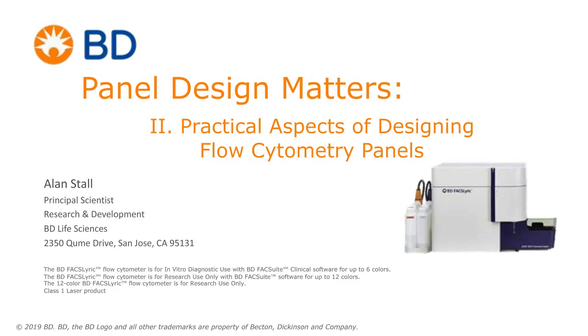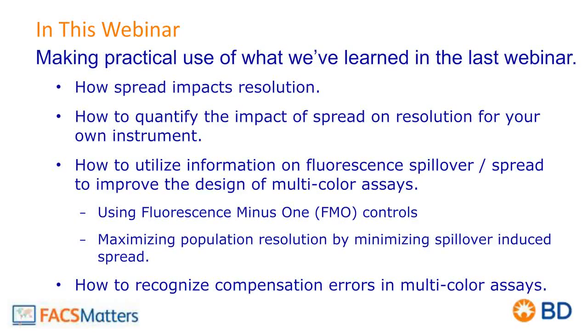Thank you very much. Welcome back everybody for this second webinar. Today we're going to be making practical use of what we learned in the last webinar. In particular, we're going to focus on how the concept of spread impacts resolution, which we'll get into with panel design, how to quantify the impact of spread on resolution, in other words, to actually have numbers that we can think about and utilize, and then how to utilize this information on spillover spread to improve panel design. We'll talk about the use of fluorescent minus one controls and then maximizing population resolution by minimizing spillover induced spread. And then we'll talk about how to recognize compensation errors in multicolor assays.